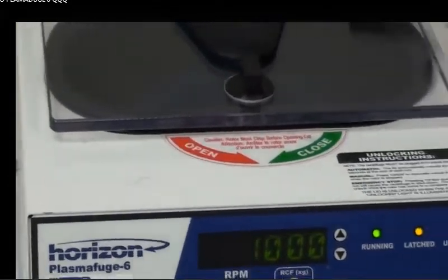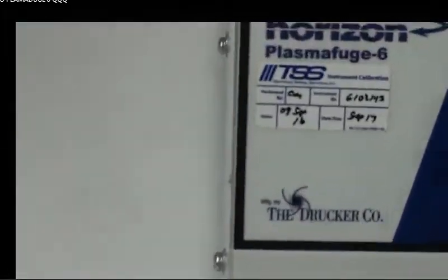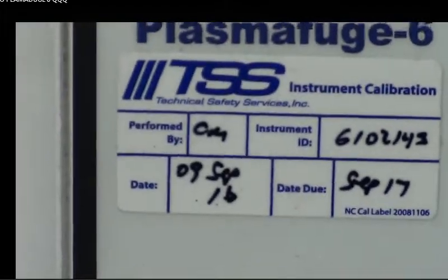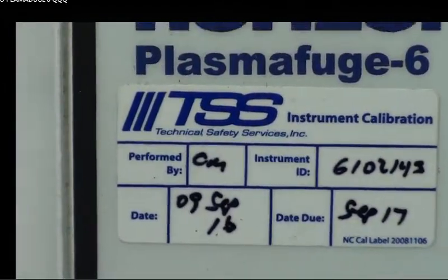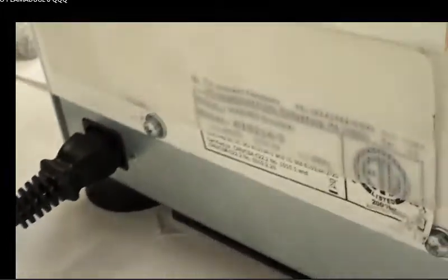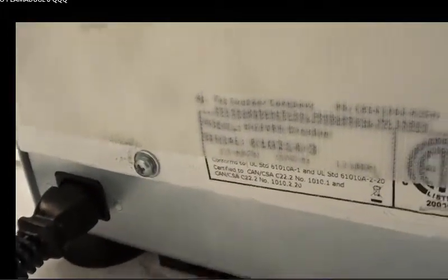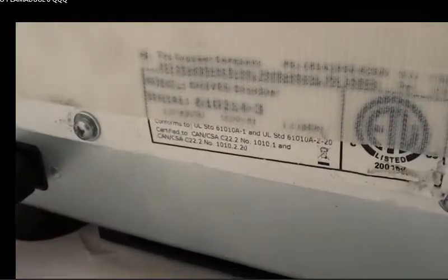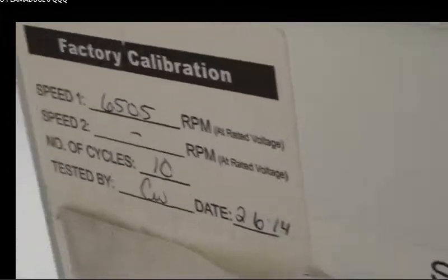I'm going to end the video by allowing Eric to get a close-up of all the details. We have the calibration on the front here as well as the model number on the back. If you have any questions, you can visit us at our eBay page at MyCyberOfficeID or our website.